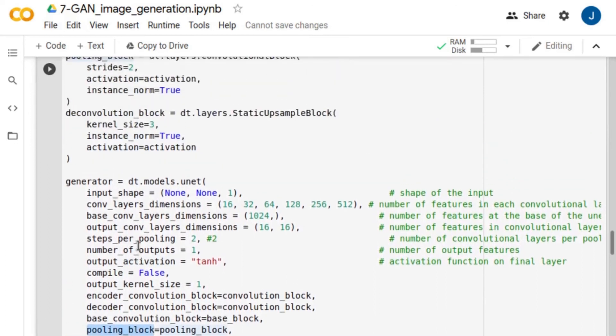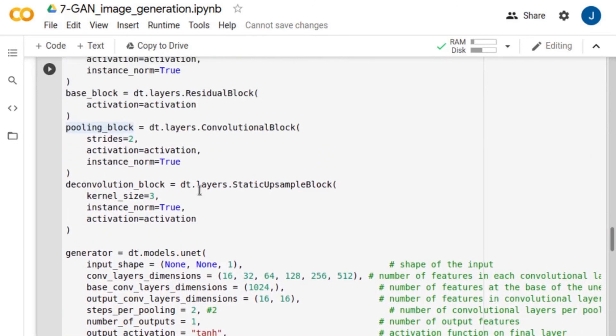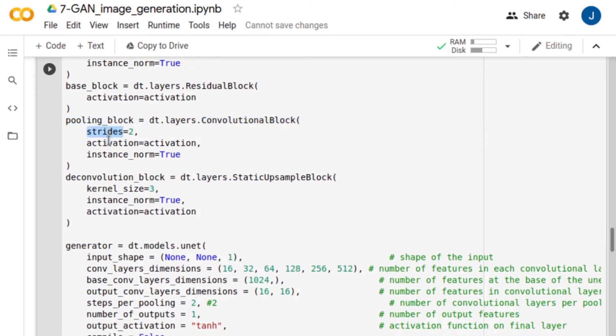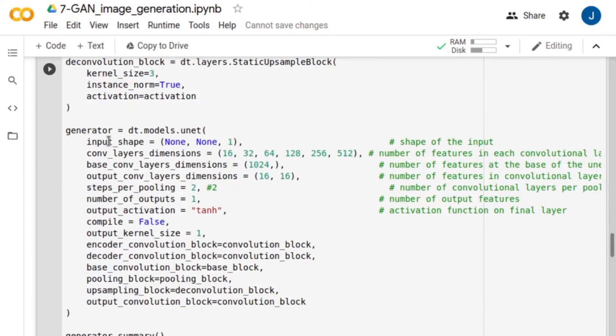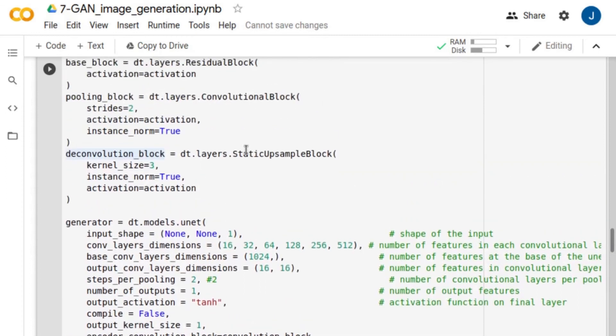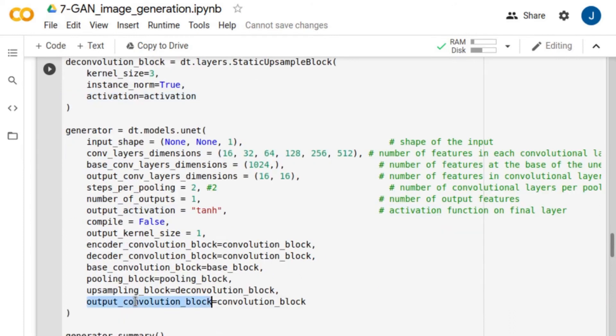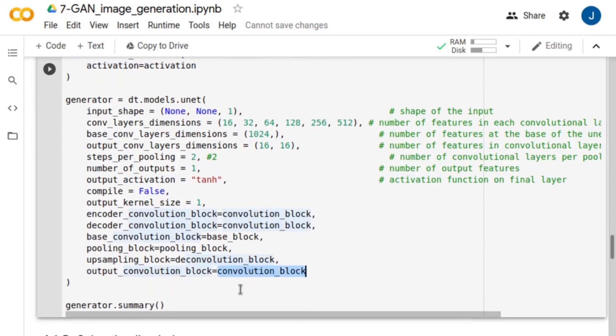For down-sampling, we use convolutional layers with a stride of 2. For the up-convolution, we use static upsample blocks, which perform a bilinear interpolation followed by a convolutional layer for upsampling. Finally, we use convolution blocks for the final layers.